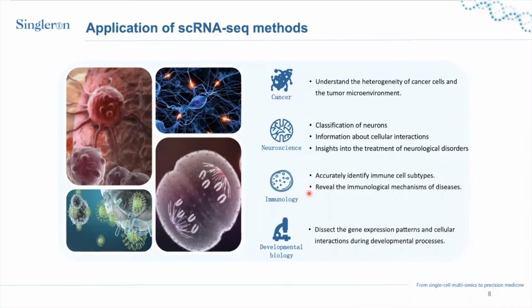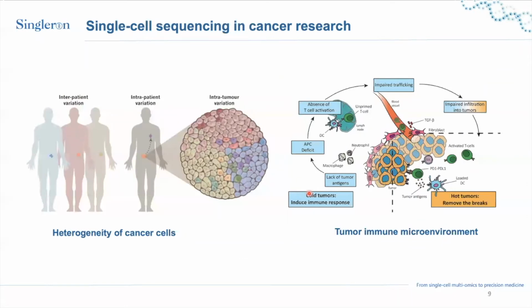Another popular field where single-cell is applied is developmental biology. People are interested in the development of certain cell lineages. And to do that, we perform single-cell RNA sequencing, and there are more techniques that I can share with you today, or in the later webinars, that help us understand the developmental processes. So as I mentioned earlier, every human being is different from each other.